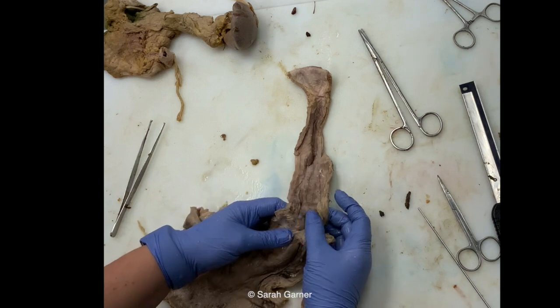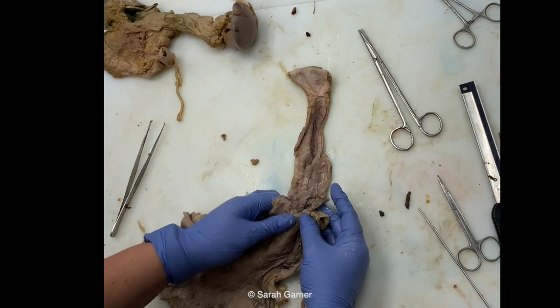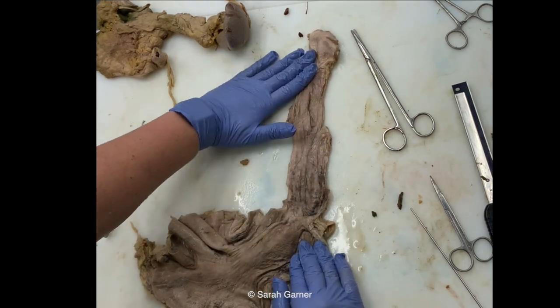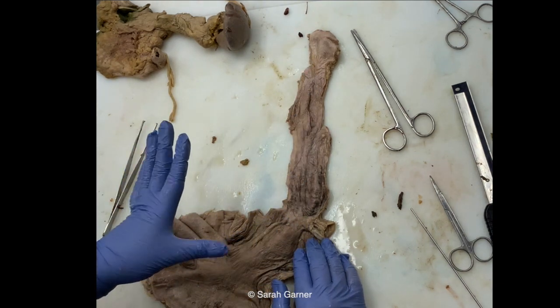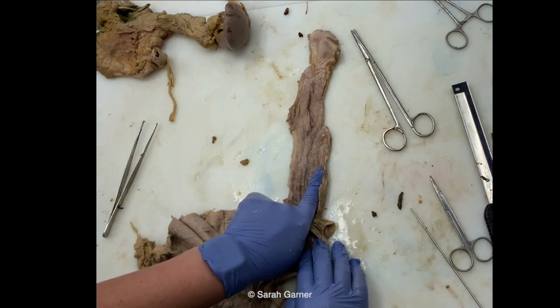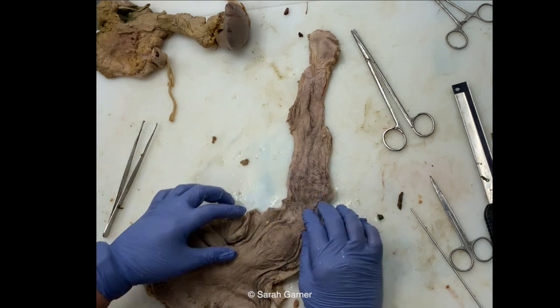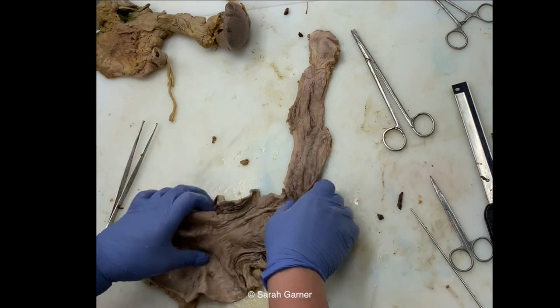The GE junction isn't as obvious as I'd like it to be, but I think part of that is just because this is fixed, so everything is more tan. But if this was fresh, this would be like white to pink, and this would be a little bit more reddish, and so you'd see a pretty sharp transition here. And if you see those salmon tongues going upwards, that is indicative of Barrett esophagus, remember? So you'd want to definitely section and note that. But otherwise, this looks pretty normal.